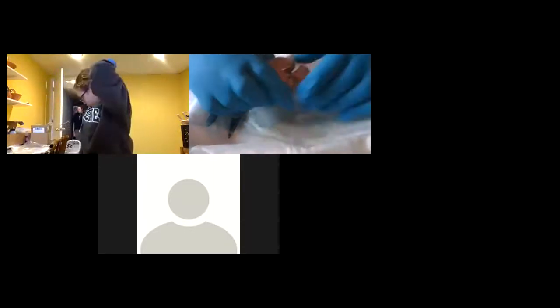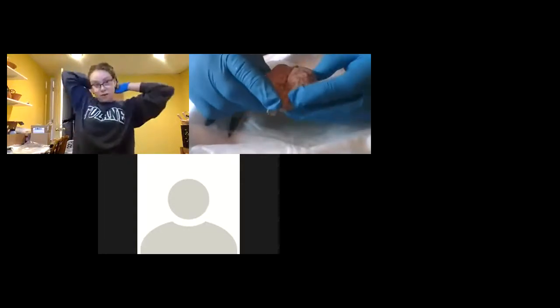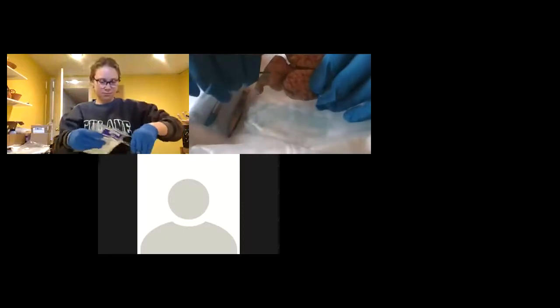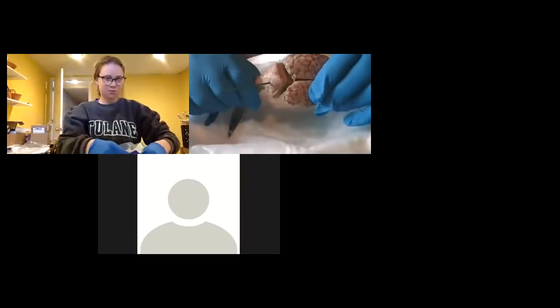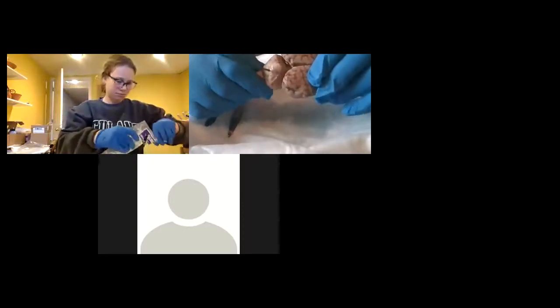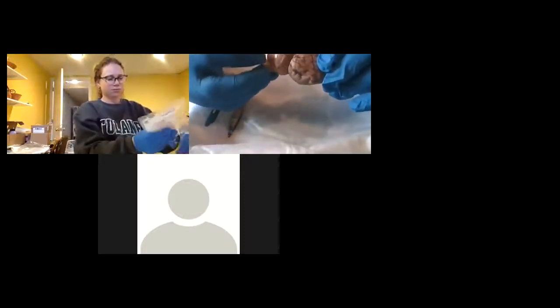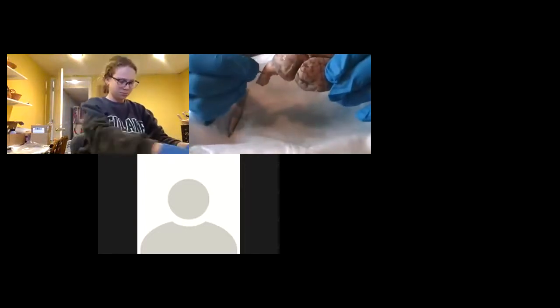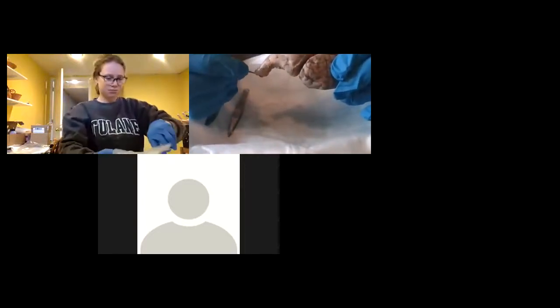So once you get the brain out, look at the external anatomy. From what you know about the brain, you know that the cerebellum is posterior when you're looking at the superficial superior view. We're looking at the top of the brain. And down here would be your brain stem. So the spinal cord would be exiting down here.